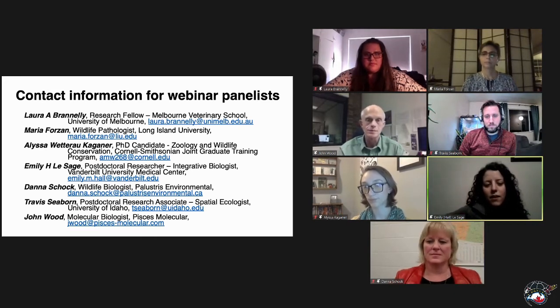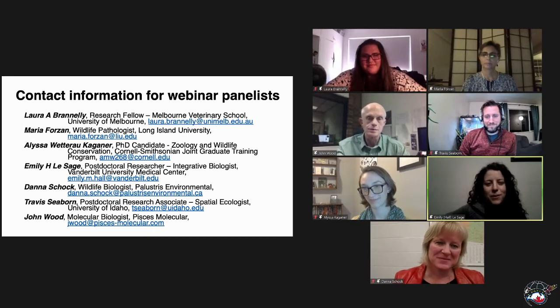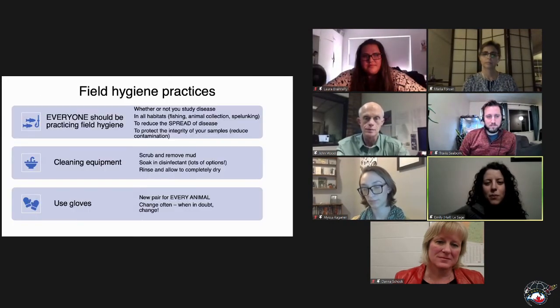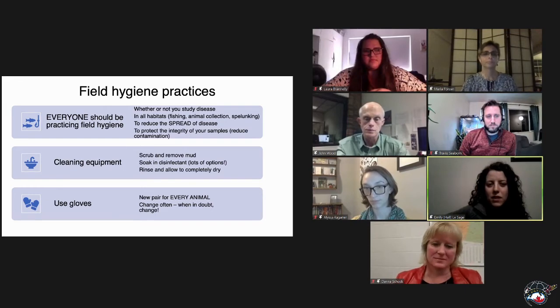And then decontamination protocols, of course. I don't think I have to emphasize that to the, I hope, crowd who is aware that before entering new sites, when you're just coming from another pond with amphibians in it, you don't want to be carrying those pathogens between sites. So, decontaminating with 10% bleach.